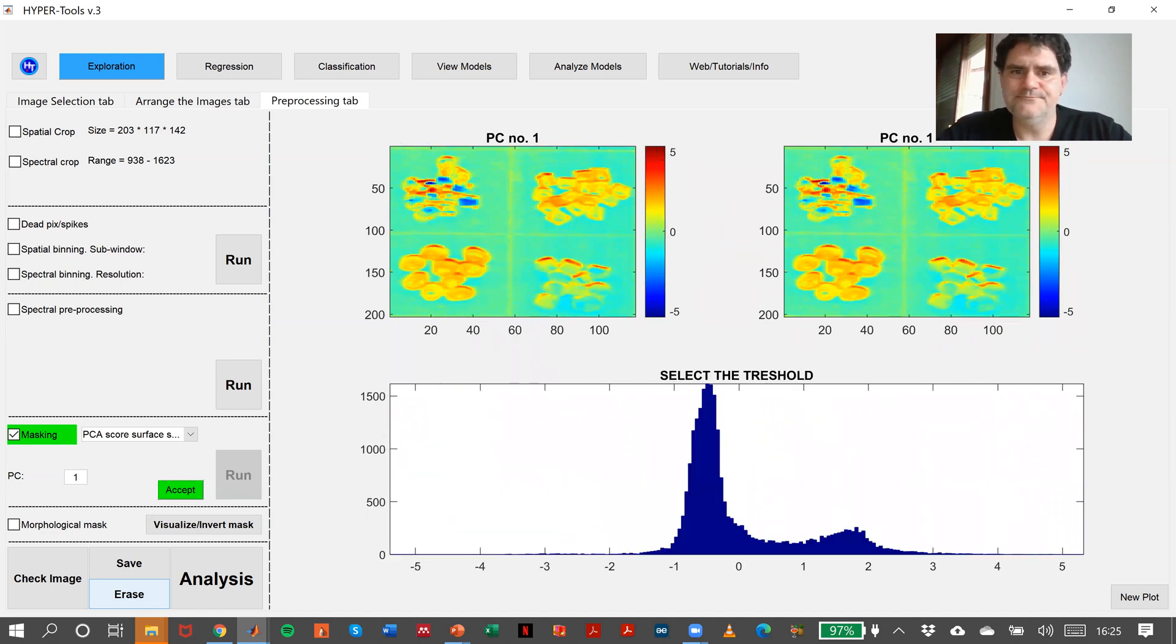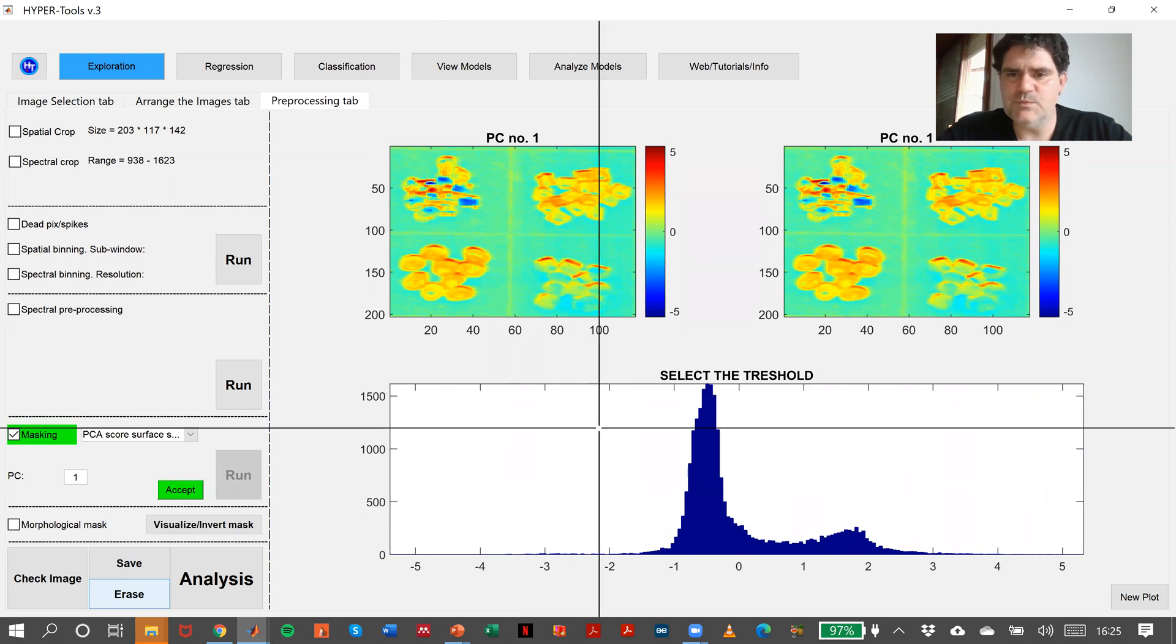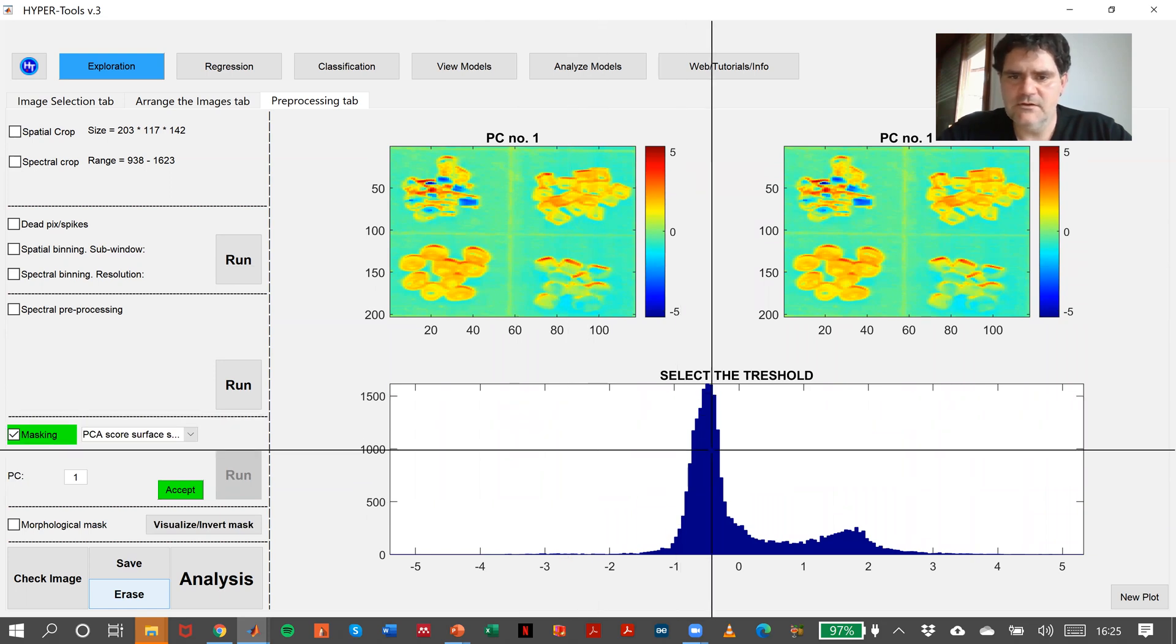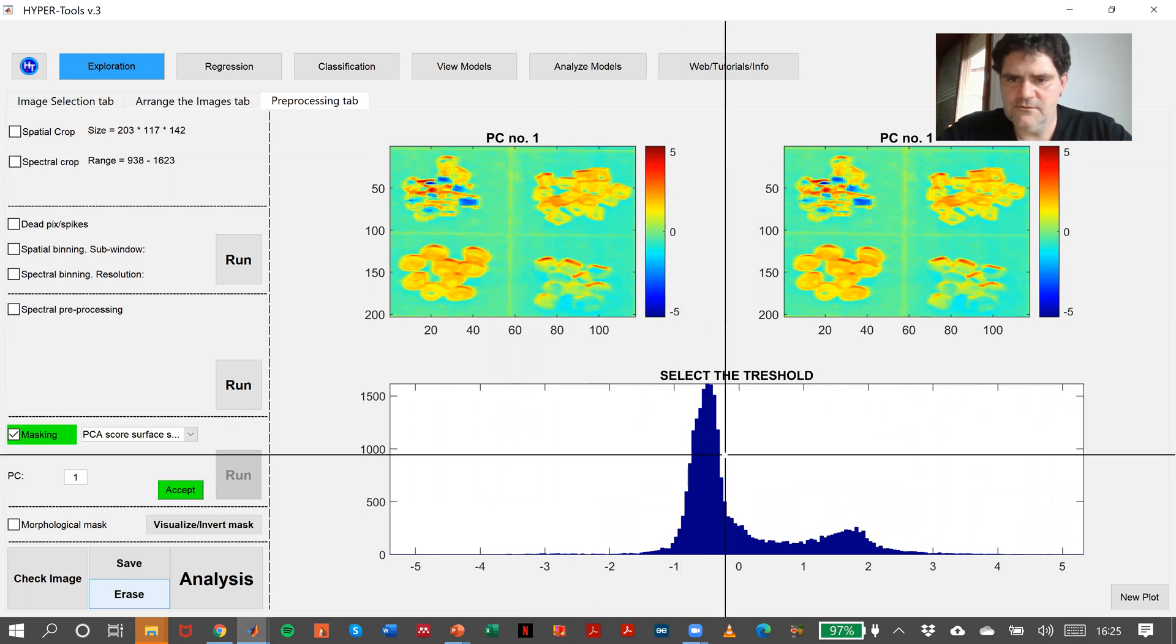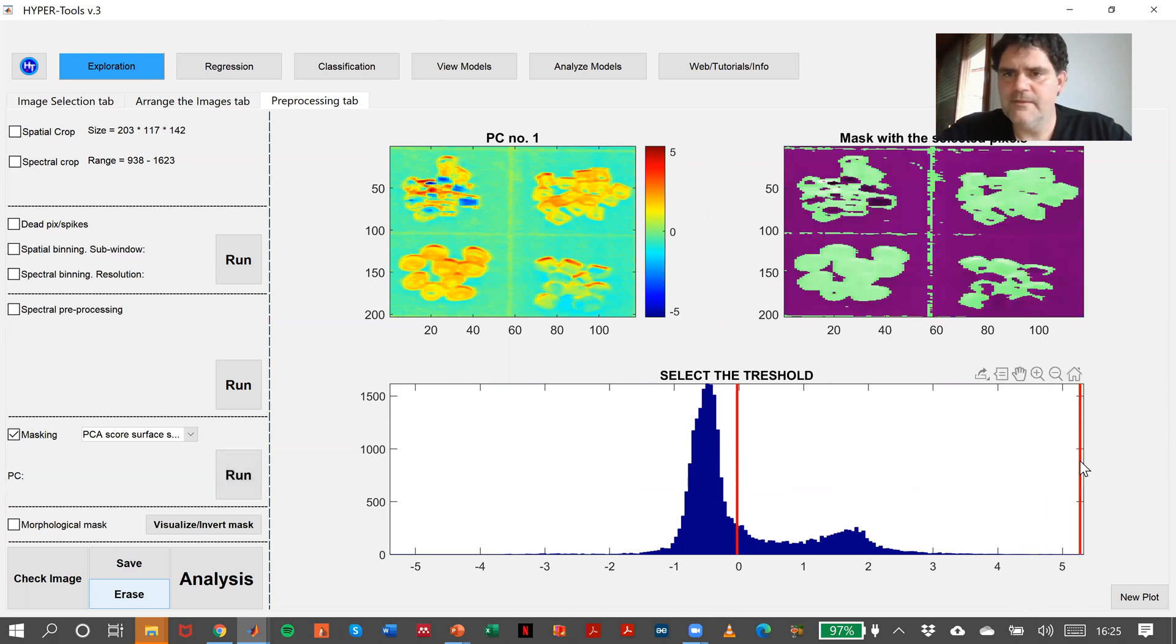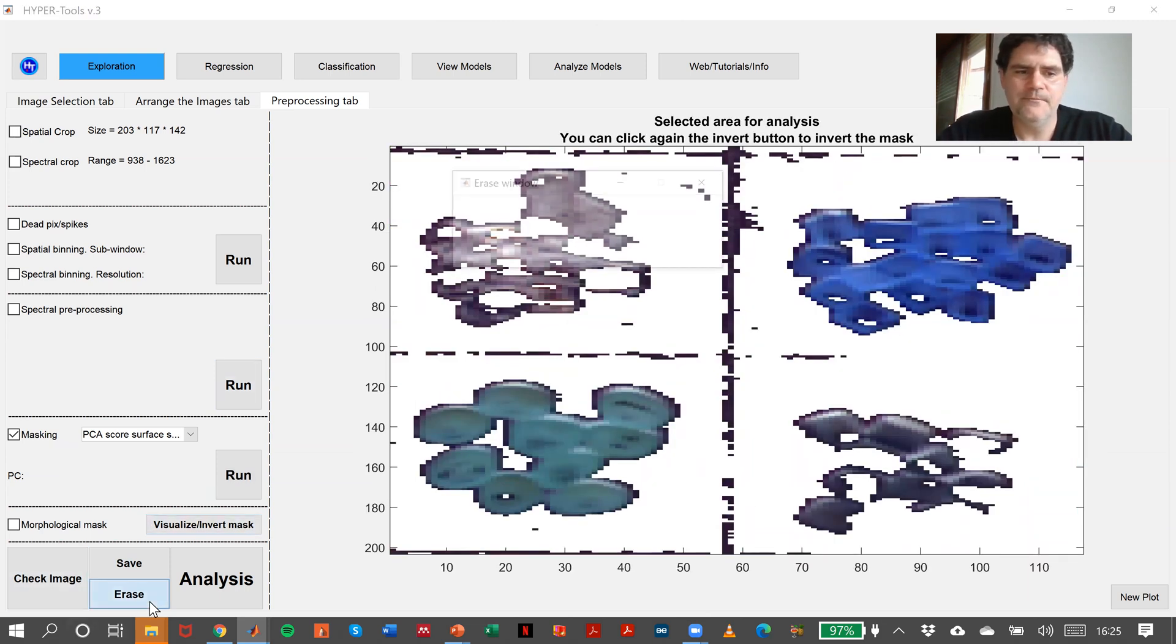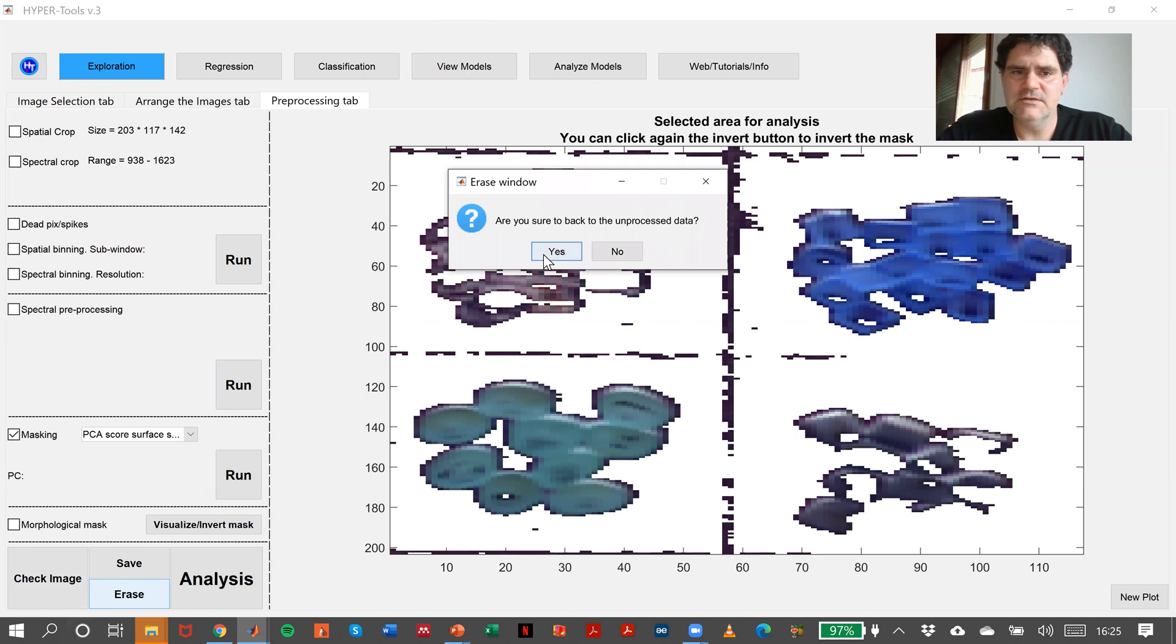And from this one, we can select which part of these pixels with this range we can analyze. It's not optimal, but okay. Erase.